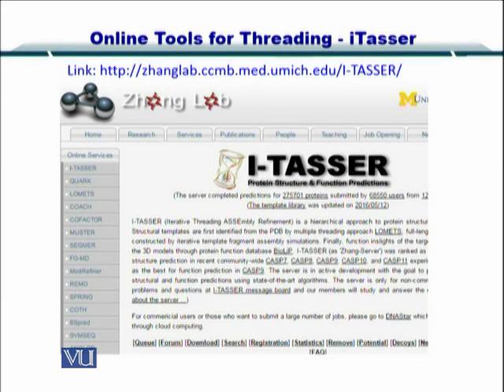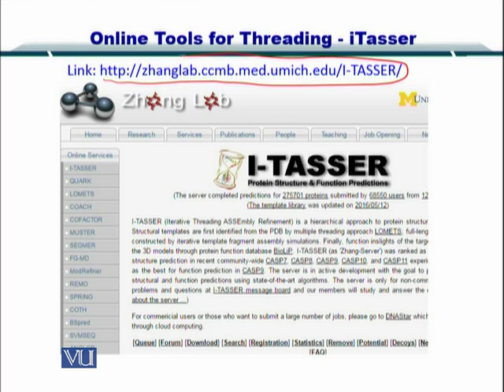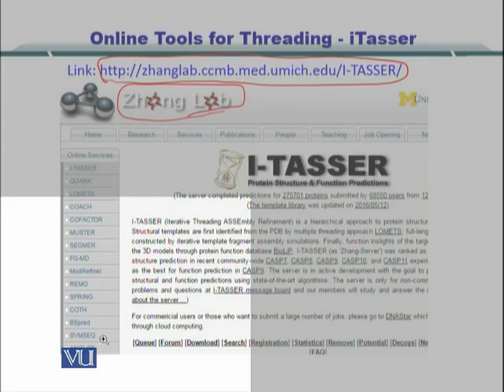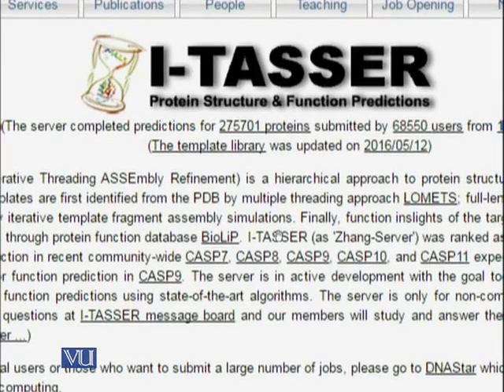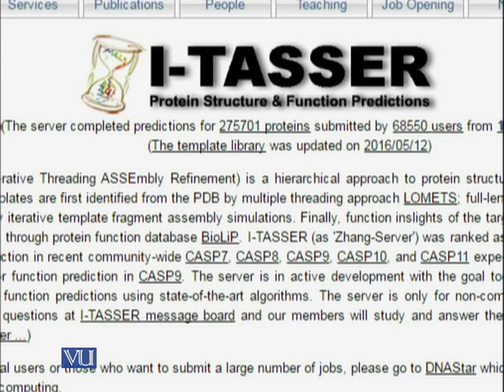Here I have provided the link for this software. You can simply click on this link or copy-paste it to be taken to the Zhang Lab server which runs I-TASSER. This is being developed at the University of Michigan and it is a fantastic tool to predict protein structures. I-TASSER is the protein structure and function predictor tool — the server has completed predictions for over 275,000 proteins submitted by over 68,000 users.